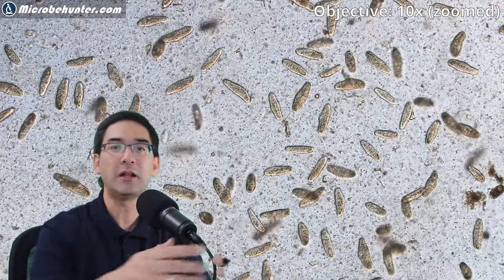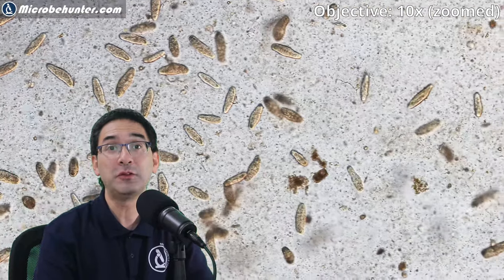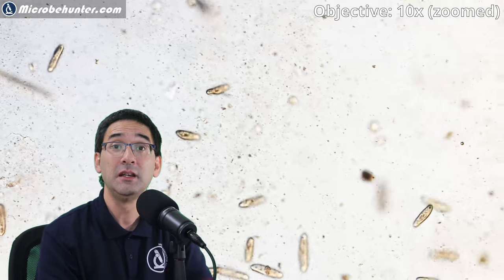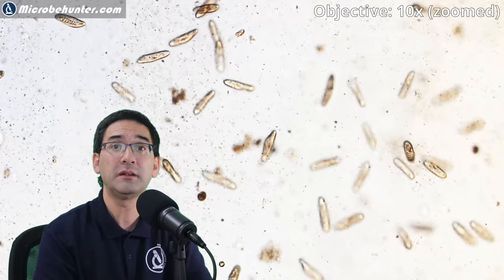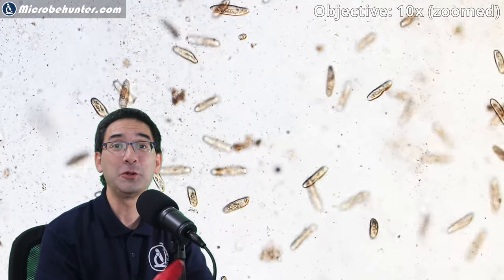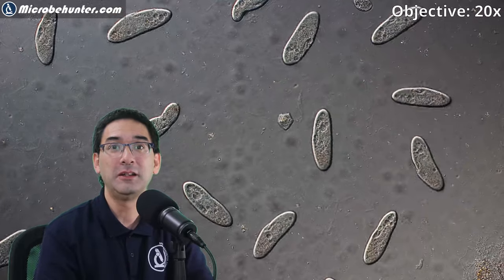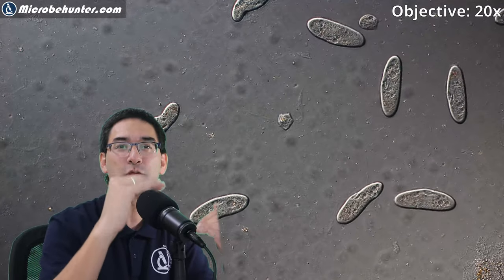There are lots of things to experiment with here. I also need to check this with peppers that are not spicy, because maybe there are other substances found in plants that have an effect on paramecia movement — it doesn't have to be the spicy substance. I've assumed it's capsaicin because the literature documents that it has disinfectant properties. Here they look a little bit thicker because the cover glass is squeezing them, so they can only rotate in one direction and cannot move as quickly.